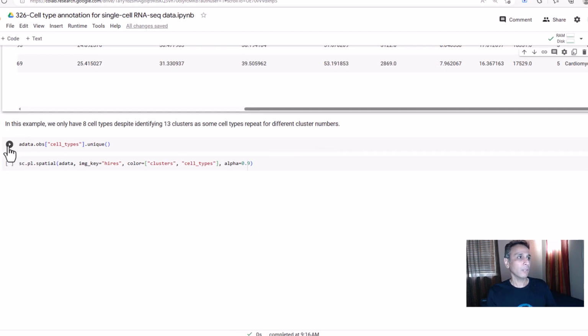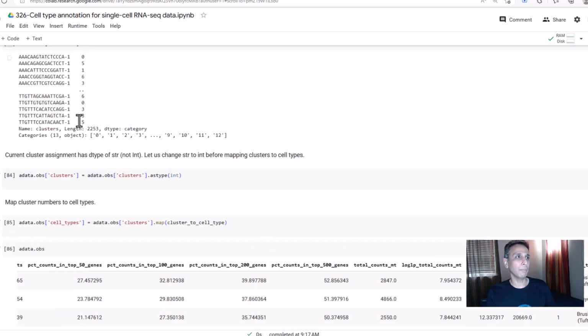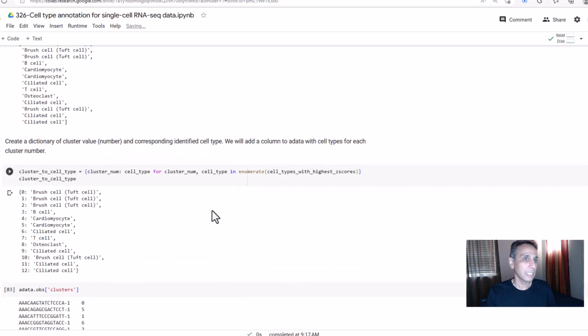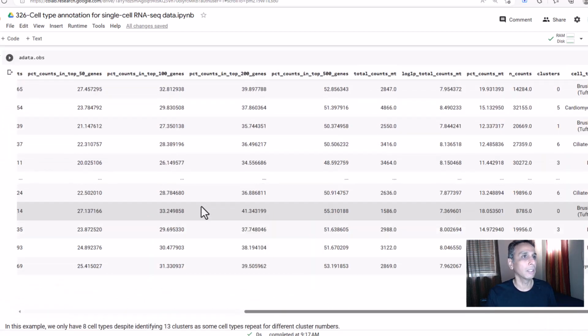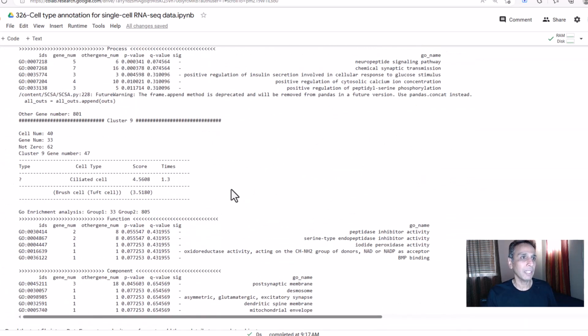And now let's look at, okay, what are the unique ones? Now 1, 2, 3, 4, 5, 6. We only have 6 types that are actually unique. Change this value, the p. Actually, let's do that. This is very important for us to, in a way, investigate this. I just want to show you how changing the p value may affect this information.